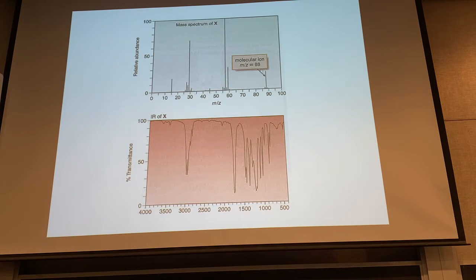But look, the mass spec is even. So what does that mean by the nitrogen rule? It either has no nitrogens or 2 or 4 nitrogens. Remember, an odd number of nitrogens means the molecular ion will be odd. Okay, and notice the fragments here are odd, because the molecular ion's even. That's a way to figure that out there. But so this is probably not an amine here.